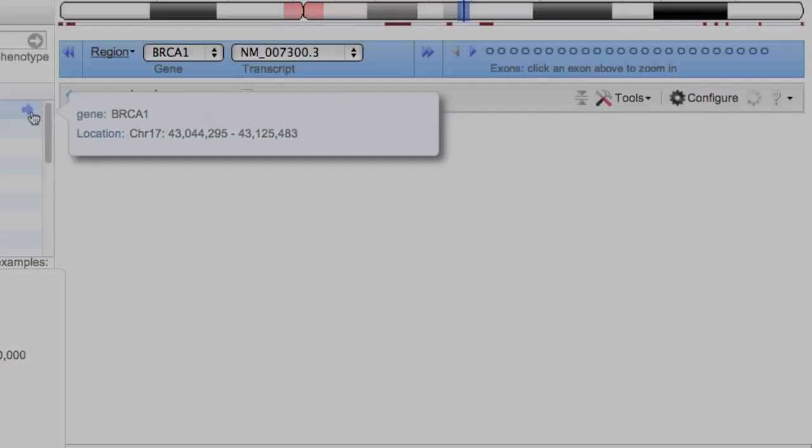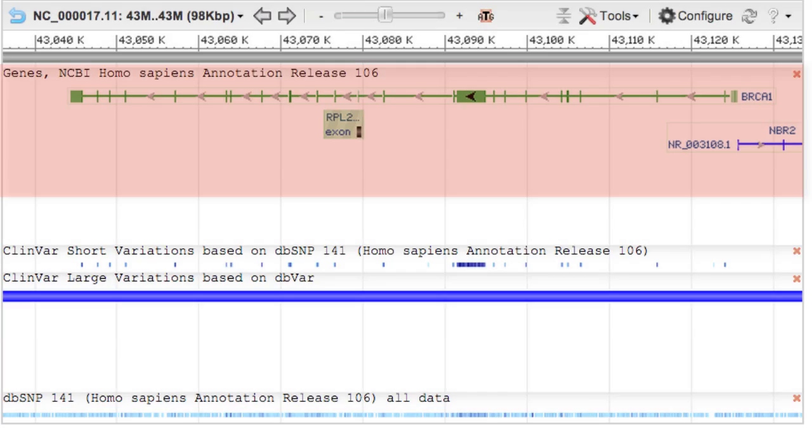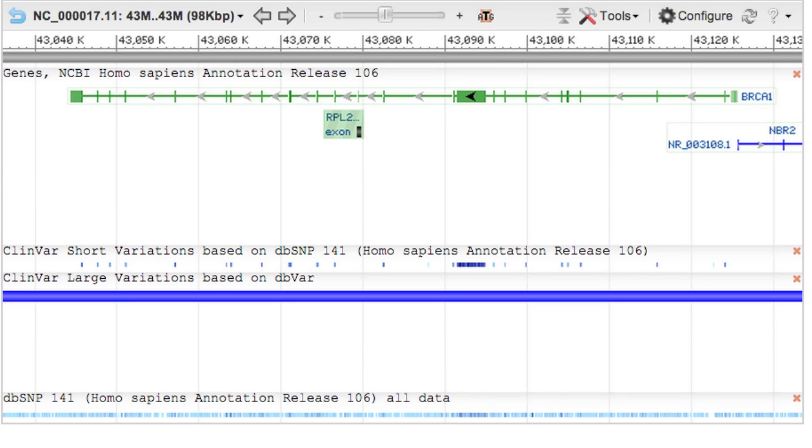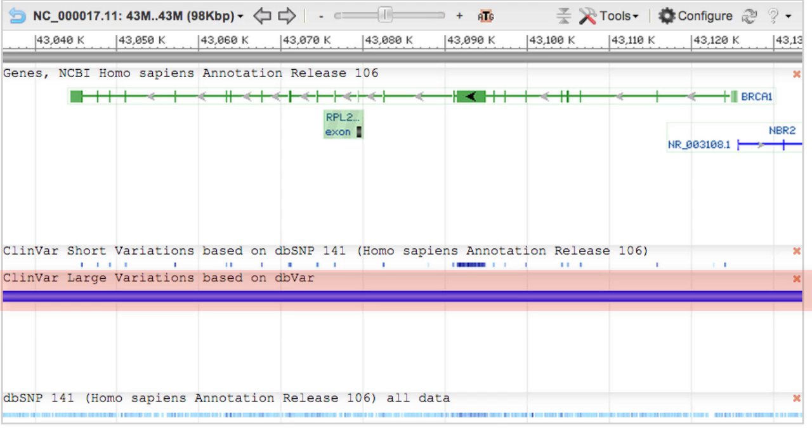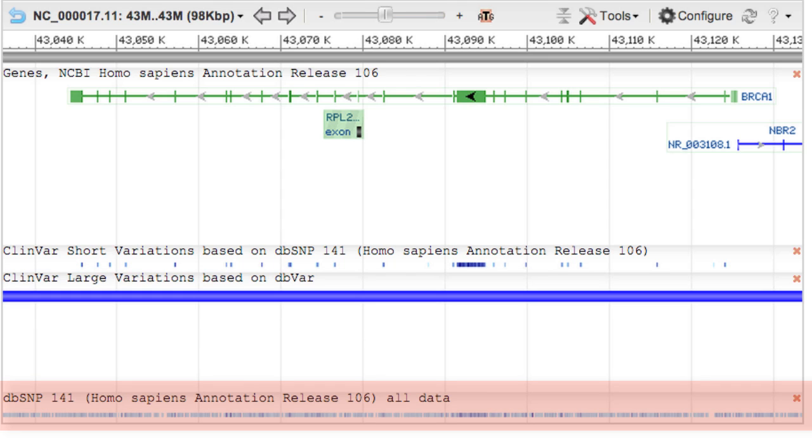The Sequence Viewer now displays a genes track centered on BRCA1 and three other tracks: ClinVar Short Variations, ClinVar Large Variations, which are structural variants from dbVar, and dbSNP.